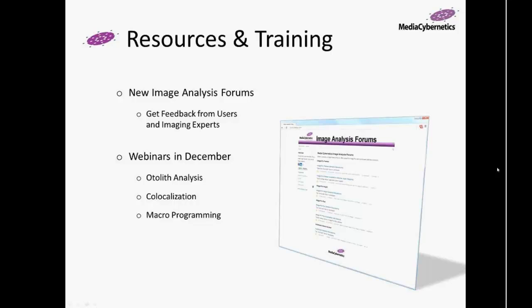about individual webinars that come out in December. We have an otolith analysis webinar with an otolith analysis expert who will be coming in and talking with all of us about how to use the brand new otolith apps for 9.1. We have an incredible researcher out of Canada who will be working with us on the Colocalization app and talking to us about best practices for colocalization.